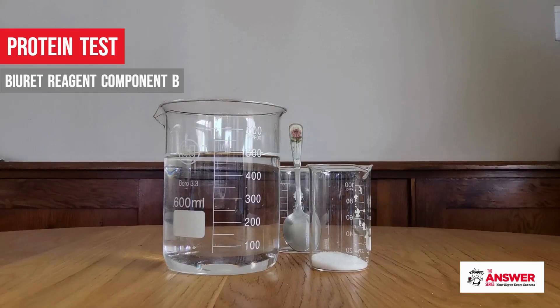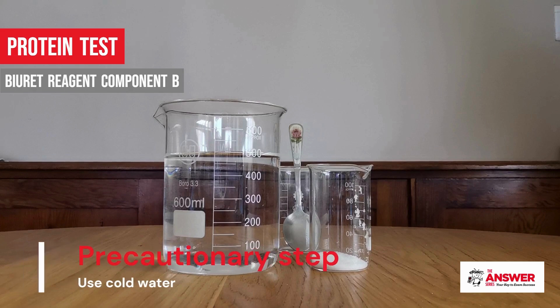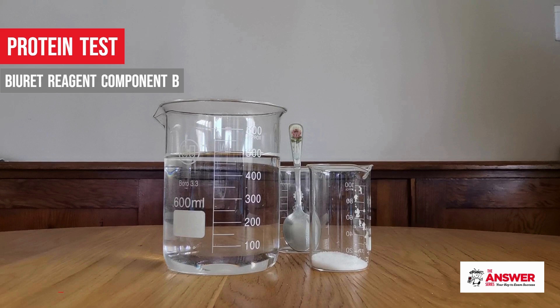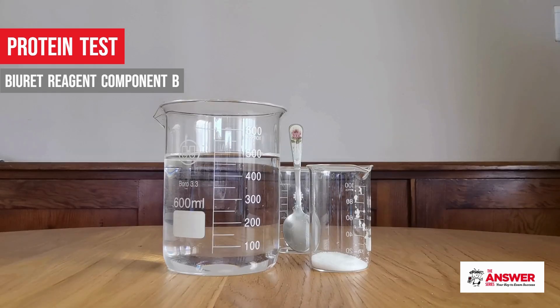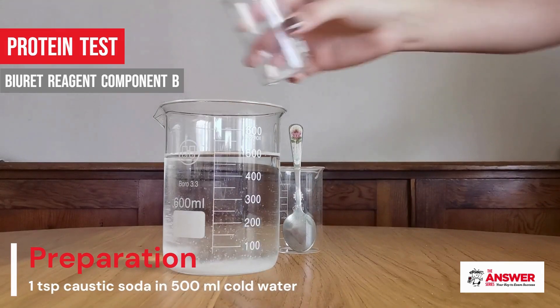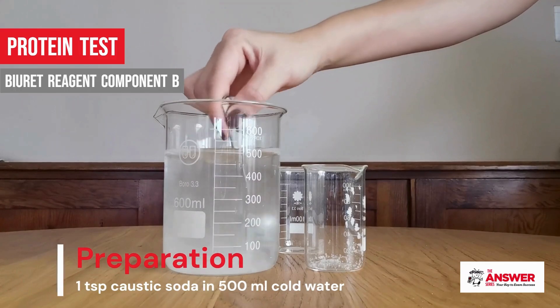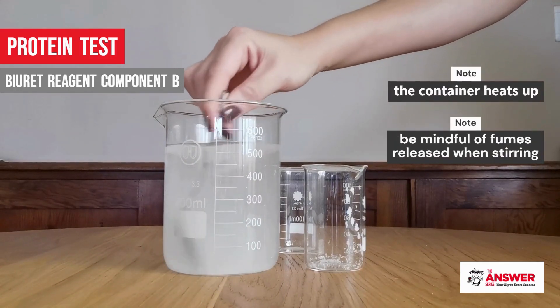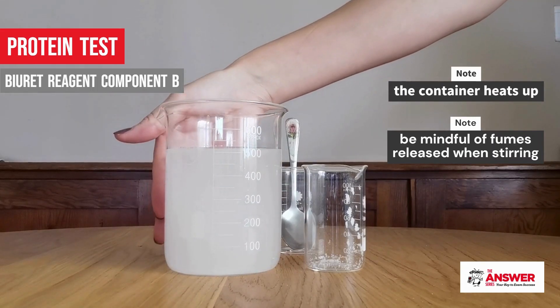Precautionary steps here include using cold tap water — never hot water, which would cause the caustic soda to bubble and splatter all over the place — and adding a small amount of caustic soda to a larger quantity of water, never the other way around. To prepare component B, add one teaspoon of caustic soda to 500 milliliters of cold tap water and stir until it is fully dissolved. You will also feel the container heat up, so preferably use a glass container of some kind.